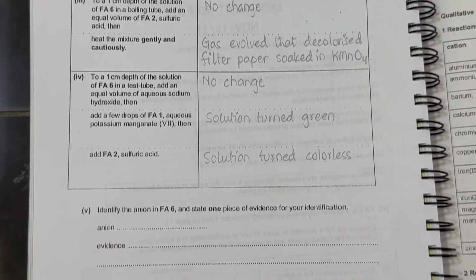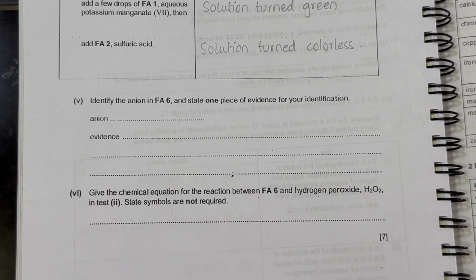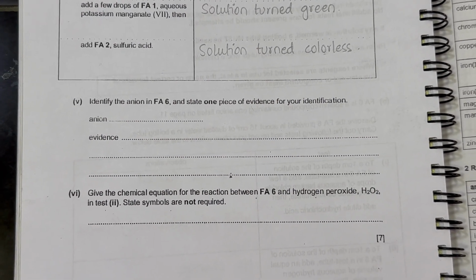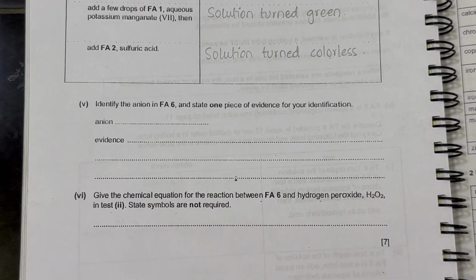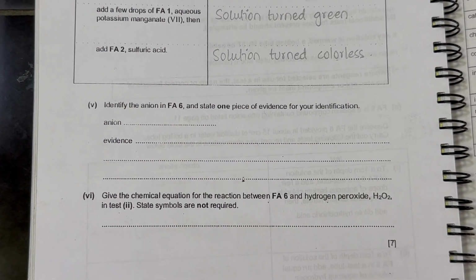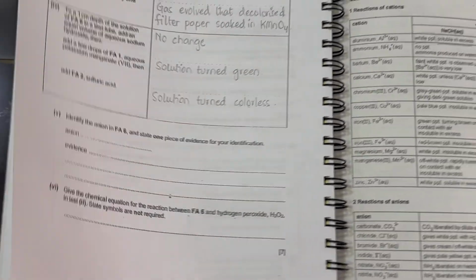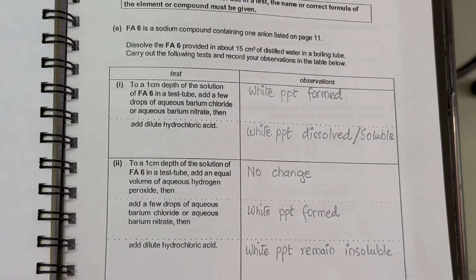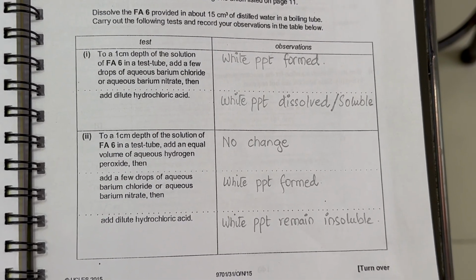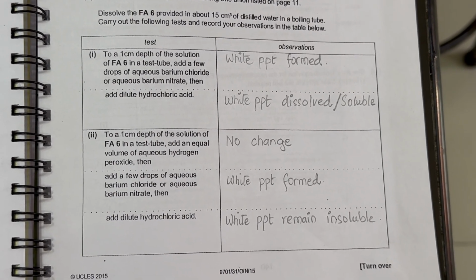Let's move on to the next part of the question, where they say, identify the anion in FA6 and state one piece of evidence from your identification. So we can conclude that this solid has sulfite as an anion present. And how can we conclude? Because of two pieces of evidence from here. If we go back in this part, we can see when we have added barium nitrate, white precipitates were formed which dissolved in hydrochloric acid. This is one piece of evidence.